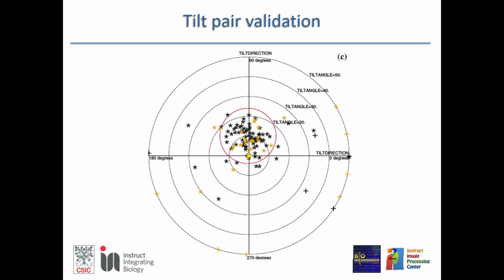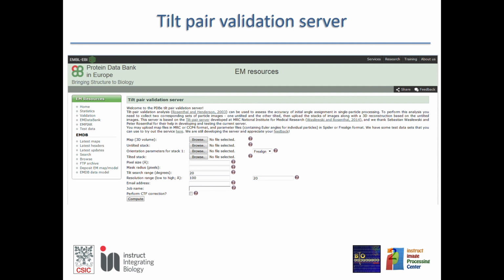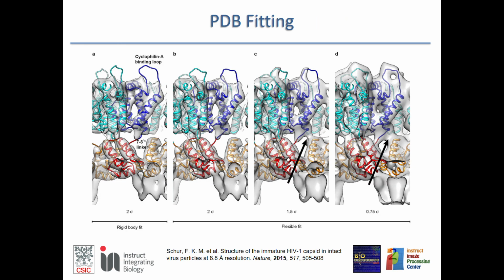So this is a very good way of checking the handedness of the 3D reconstruction. And there is a server where you can submit your data and then see whether you have the correct hand or not.